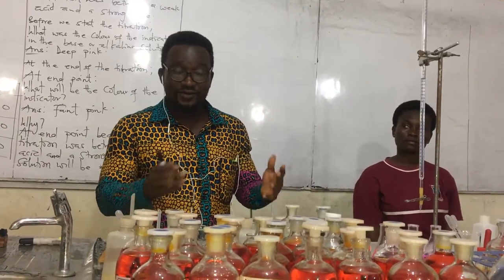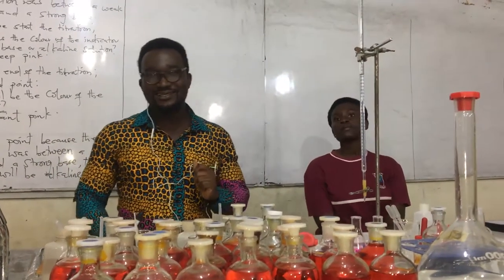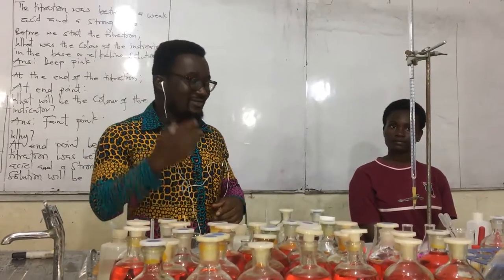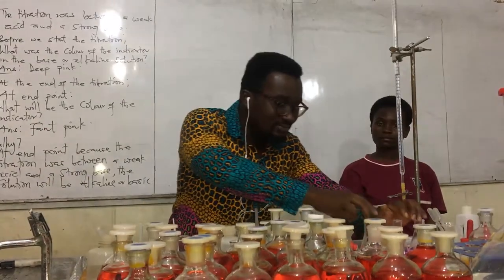In fact, you can also choose phenolphthalein. Phenolphthalein can also be best. Why? At the end, the solution will be neutral. I said we will discuss a lot. In fact, our madam is ready to take us through the second part, which is strong acid and then strong base.